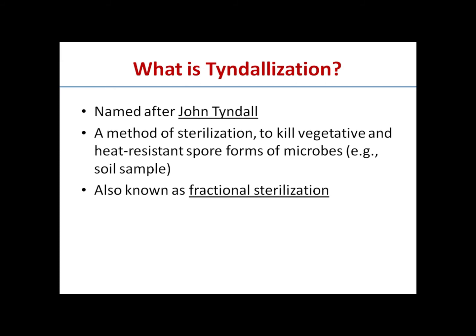The process is named after John Tyndall. It is a method of sterilization to kill vegetative and heat resistant spores of microbes. In plant pathology, we use this process to sterilize samples of soil.